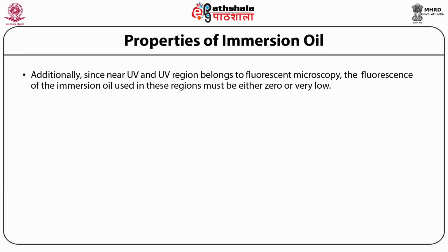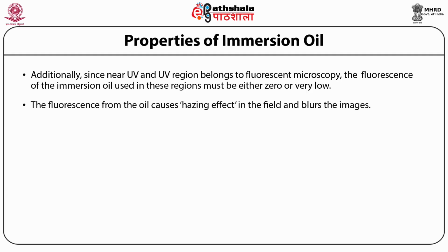Additionally, since near UV and UV regions belong to fluorescent microscopy, the fluorescence of the immersion oil used in these regions must be either zero or very low. The fluorescence from the oil causes a hazing effect in the field and blurs the images.